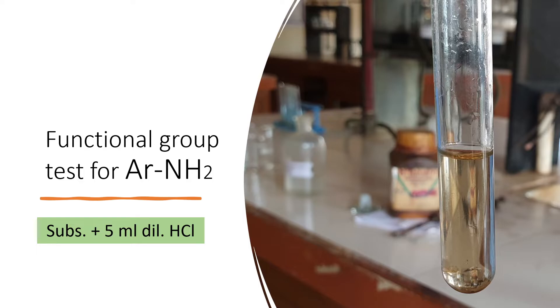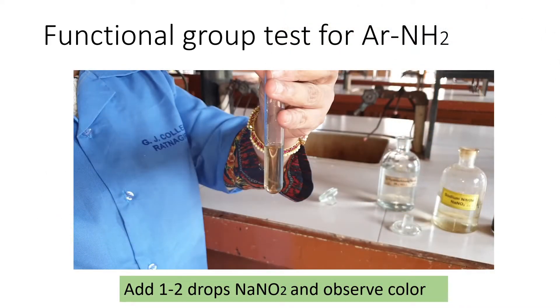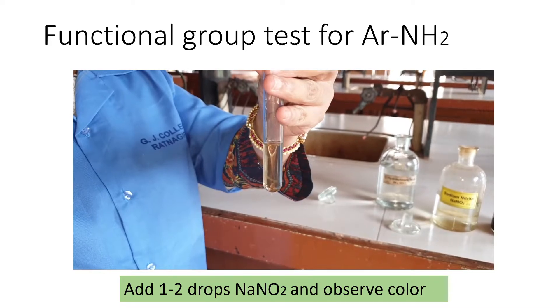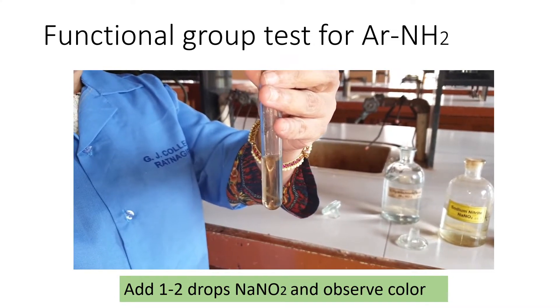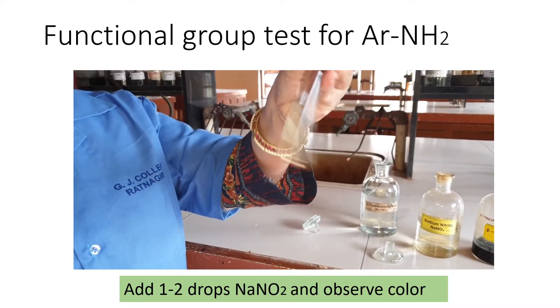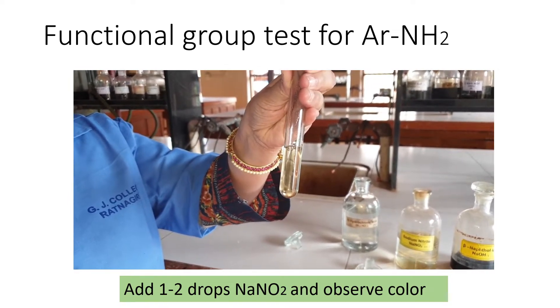Students often make the mistake of adding too small a quantity of HCl. Remember to add a sufficient quantity of HCl so that the substance will dissolve. Now to this we add 1–2 drops of NaNO₂ using a Pasteur pipette. A common mistake here is adding a large quantity of NaNO₂ — don't make that mistake, otherwise it will spoil your test.